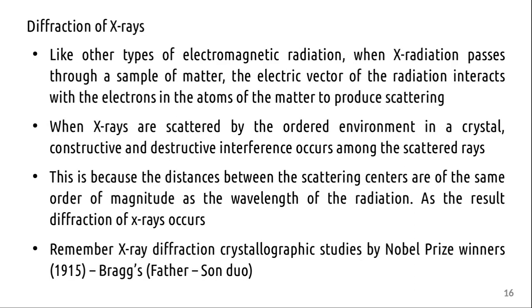Diffraction of X-rays. Like all electromagnetic radiation, X-rays, when interacting with the crystal lattice, will undergo diffraction, because the lattice is a very ordered structure. That will lead to constructive and destructive interference, which are characteristic of each crystal. This is the basis of X-ray based crystallographic studies. X-ray diffraction, XRD, is a very valuable tool to characterize material. We'll discuss XRD in the subsequent section.